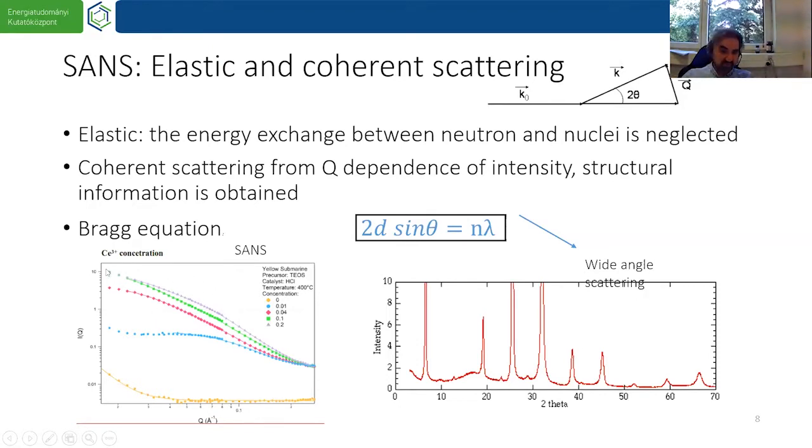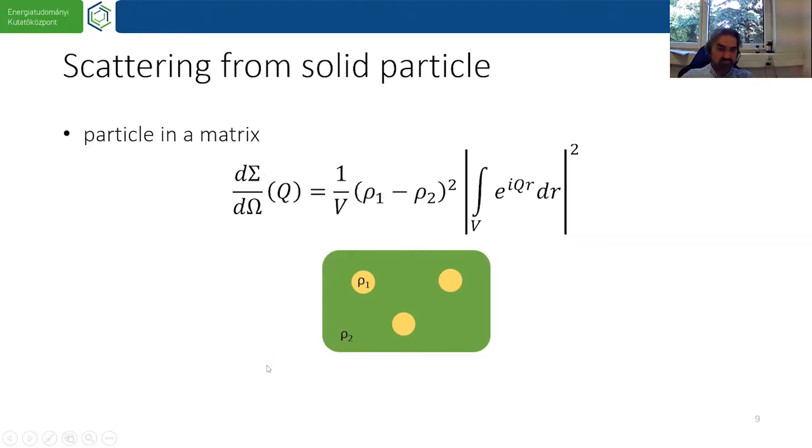In the small angle scattering domain, the curves look more featureless, I would say. So they don't have sharp peaks usually, but they have various parts of curvature which are not always easy to understand or call without any analysis, and even data modeling can sometimes lead to ambiguous results. So we will see how it works in some real samples later.